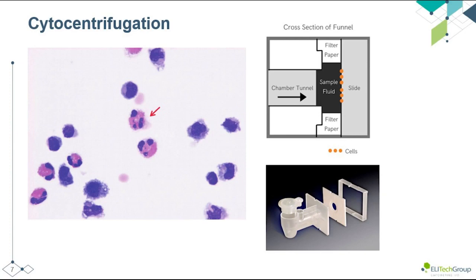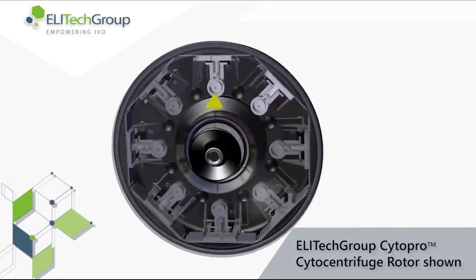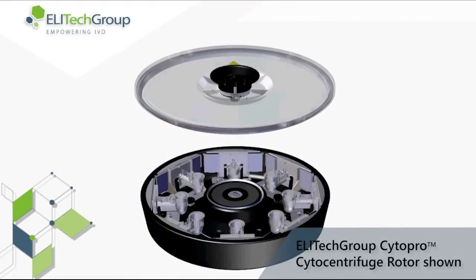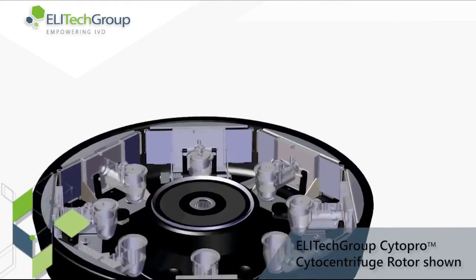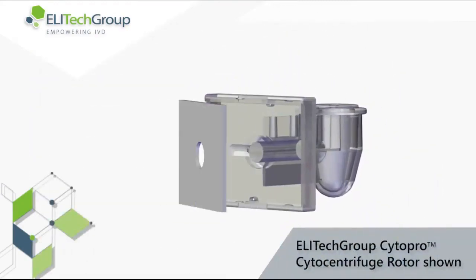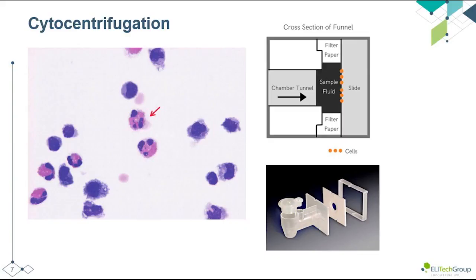There are many different methods of cytocentrifugation, but they all share the same concept. In general, a liquid sample is placed in a chamber and then loaded into a centrifuge with the sample slide. As the centrifugal force pushes the liquid and cells outwards, they land onto the sample slide. There is usually some sort of a pad to absorb the majority of the extracellular fluid. The cells that then remain on the slide will be in a small area and much easier to find.